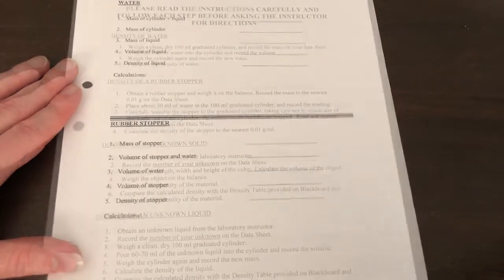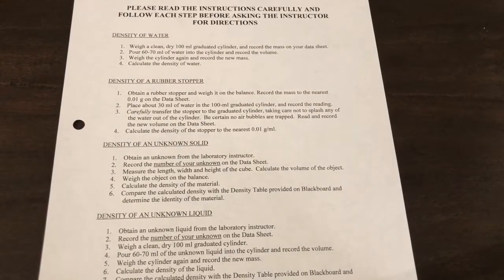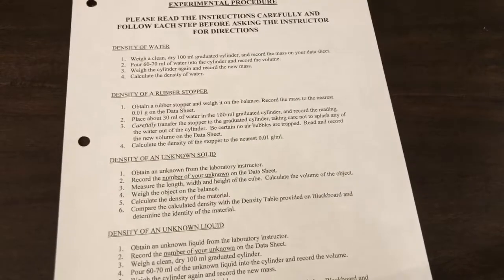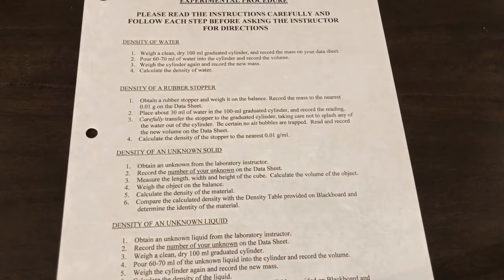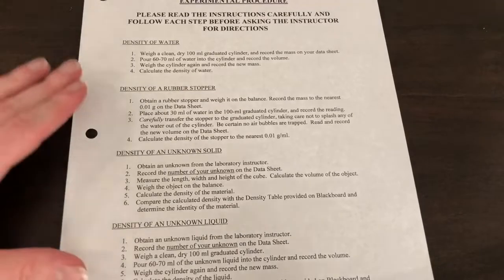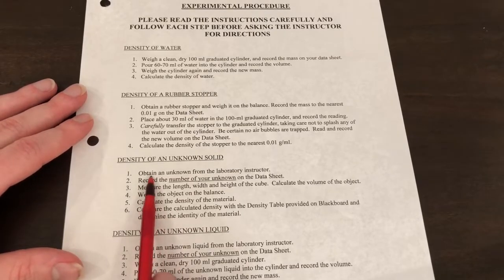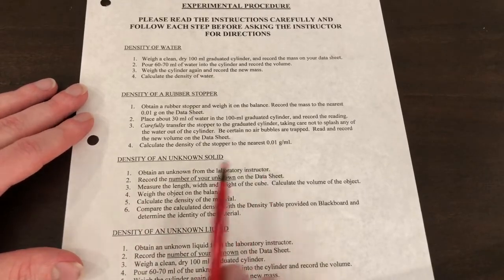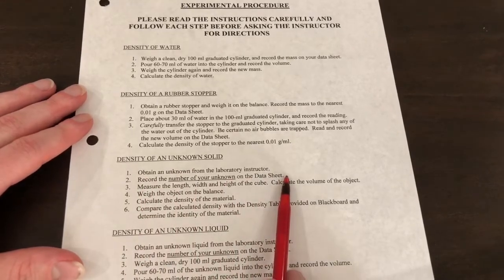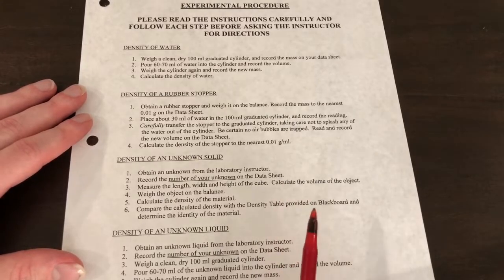Okay, so the next part of the lab is finding the density of an unknown solid. In lab, we have a big box full of blocks, different metals: aluminum, tin, brass, I think copper's in there also. But I just chose 2 for this lab for the video. So what you're going to do is obtain an unknown from the laboratory instructor and record the number of your unknown on the data sheet. Well, we just have 2 of them, so we're just gonna go with the calculations in our video.